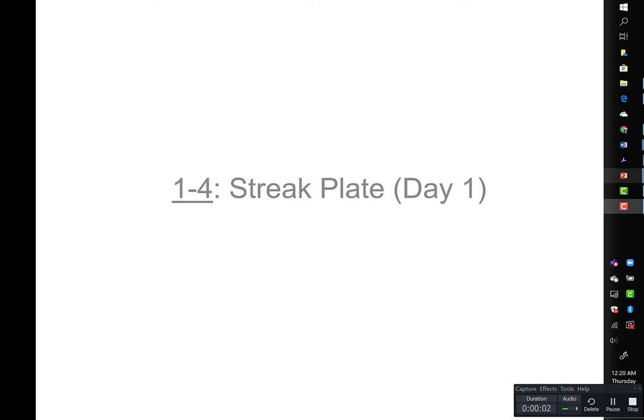In this experiment, we are going to look at a streak plate to streak for isolation of bacteria. This is activity 1-4.